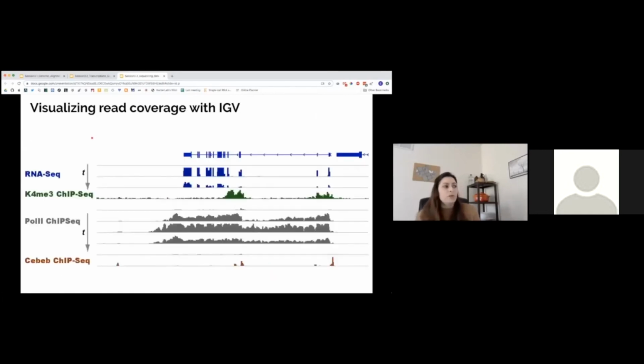You don't use it only for RNA-seq alignments; you can use it for multiple kinds of alignments, and you can input multiple different libraries to a single browser view. For example, here I have 3 time points of RNA-seq that I'm looking at, and now I'm looking at only coverage tracks, so only the depth of coverage and how many reads were mapped to that position, not each alignment by itself.